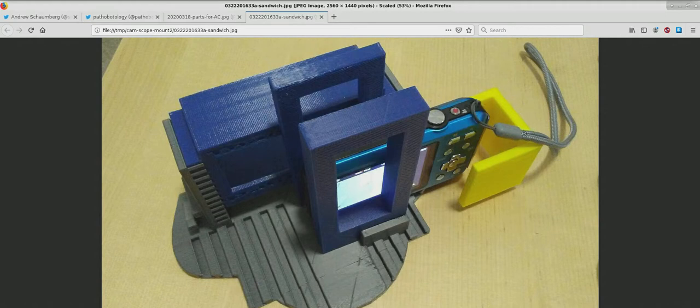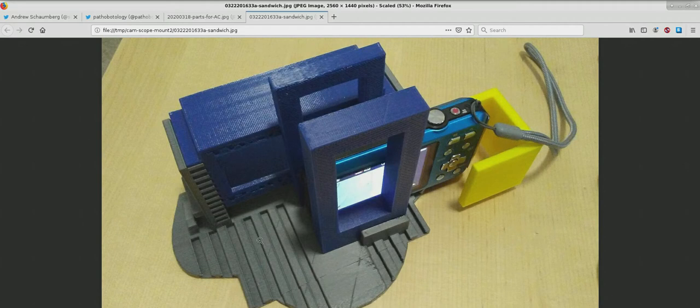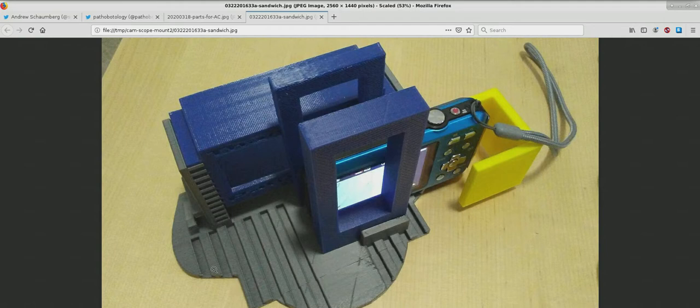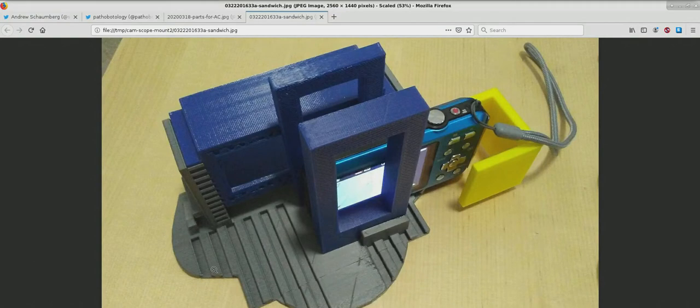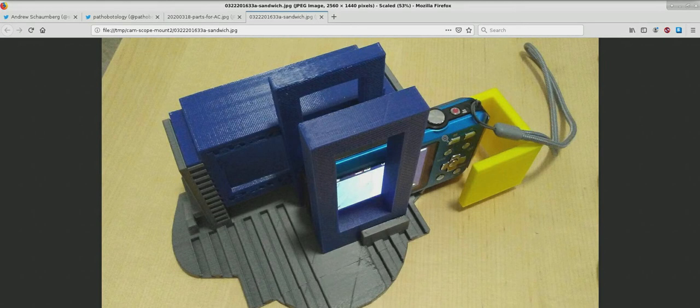On the sides, guards—I've only shown one yellow guard here—but guards on each side are important, especially at first when we're learning to use the system and it's most at risk of tipping over. Have those guards on the sides to prevent the camera from sliding off laterally.